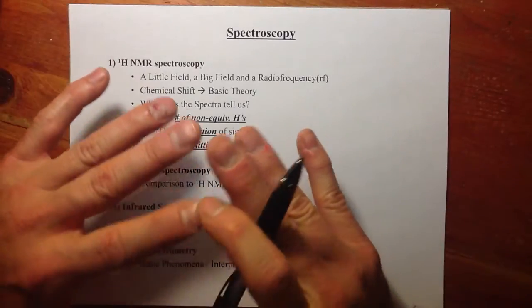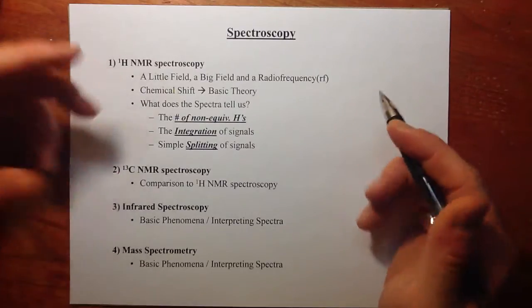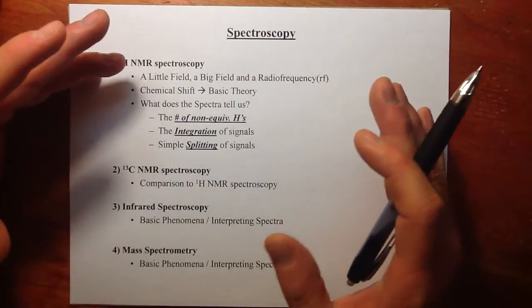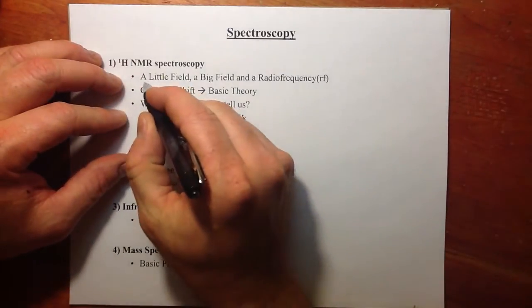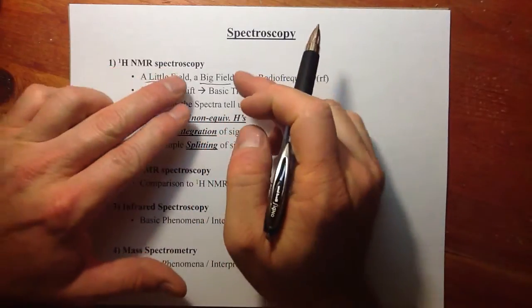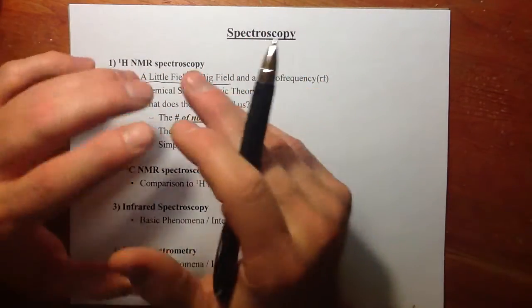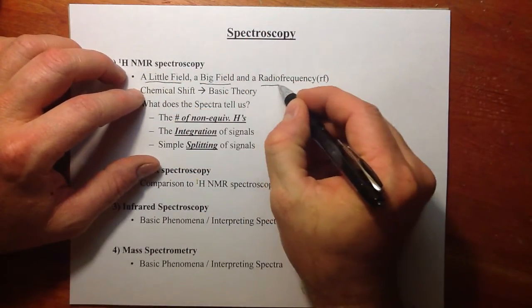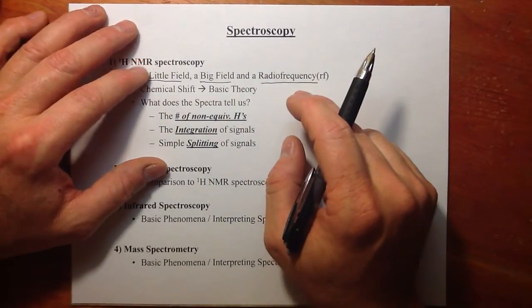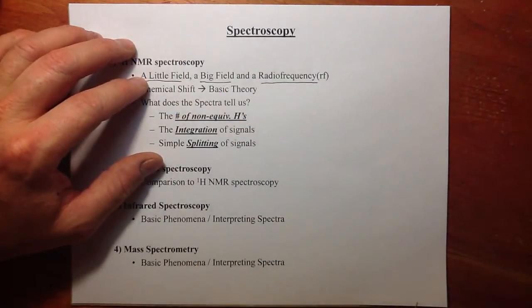This first video is just an overview of NMR spectroscopy, whether it be proton or C13. What I want to do is just discuss the very important 3 players in the drama we call NMR spectroscopy. You need to have a little field. This is from the sample. A big field. This is where the money is in the instrument. You have a huge electromagnet or a permanent magnet in the NMR. And the climax of the play will be due to an applied radio frequency from the instrument to the sample. So we're going to talk about that.